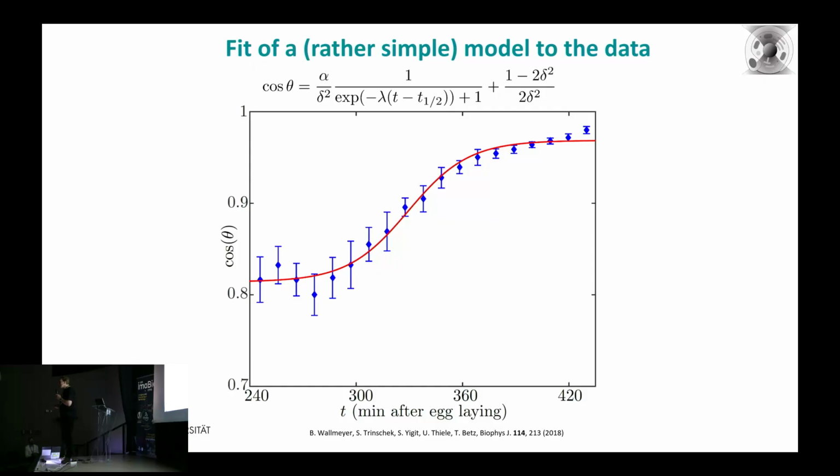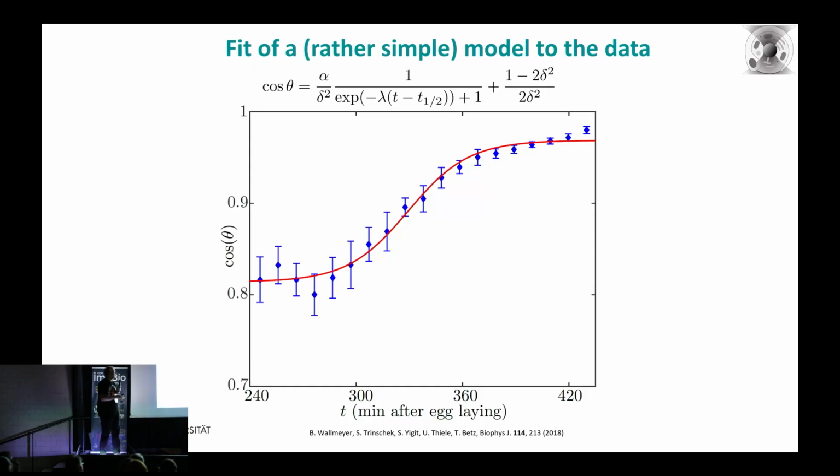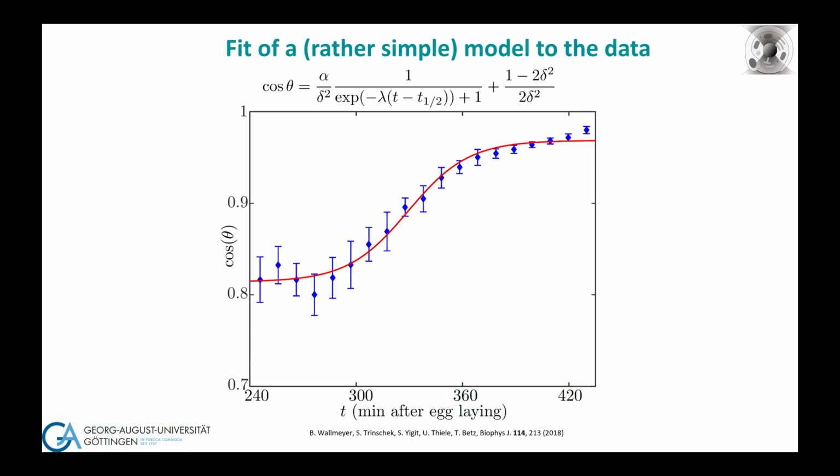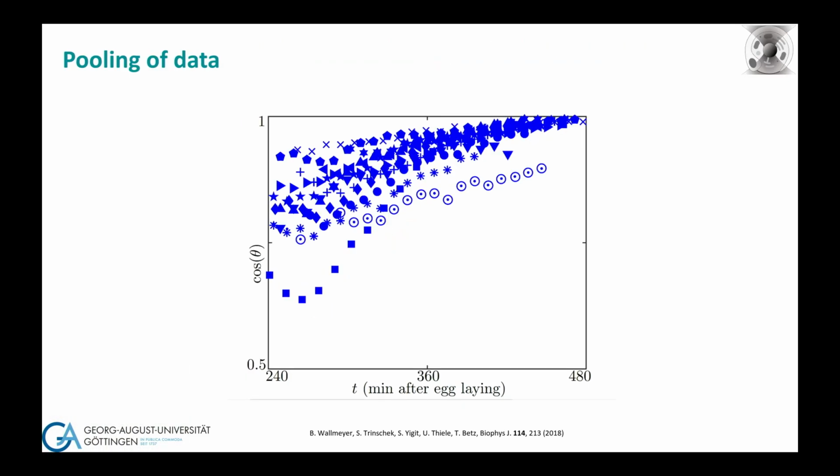And then, of course, he was very, very happy and proud. And I hated to tell him, but you know, this is biology. This is this one example that you made. You actually have now to measure more and more of these. And I was just not expecting that this will work all the time. So he went back to the lab, and these were over, I think, something like 10 to 15 embryos here. And you can already see each of them is different.